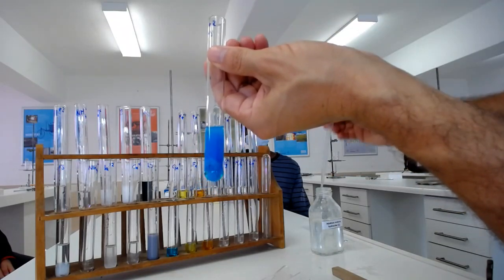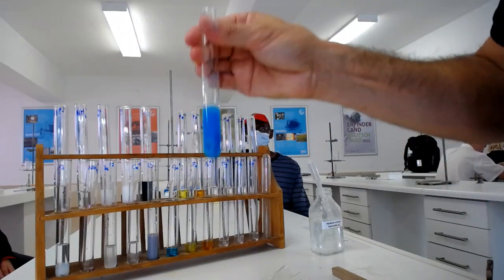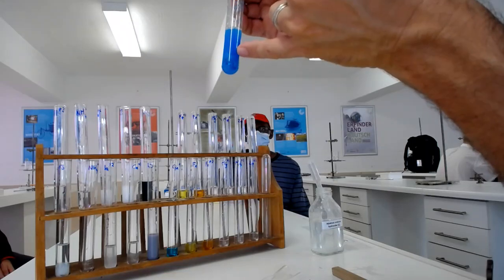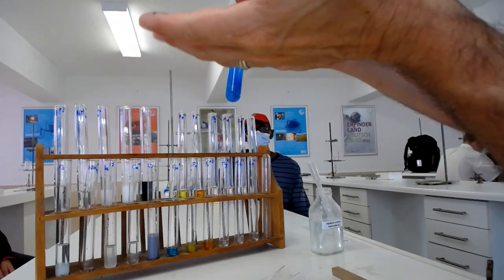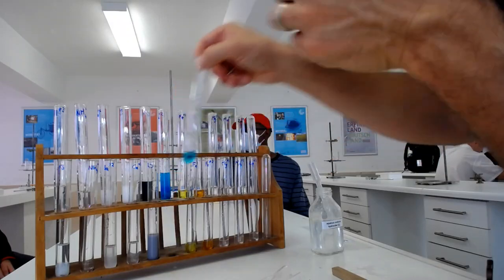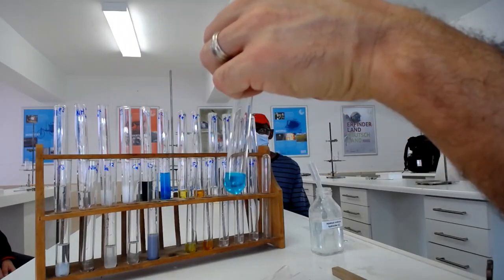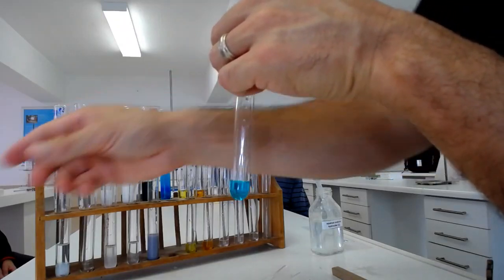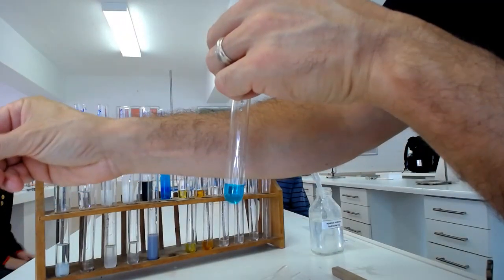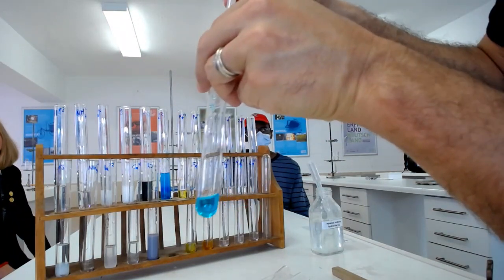Okay, there we go. So insoluble, that gunk is still sitting in there. That's with copper sulfate crystals. That's with copper sulfate. Okay, copper ions, ammonia.